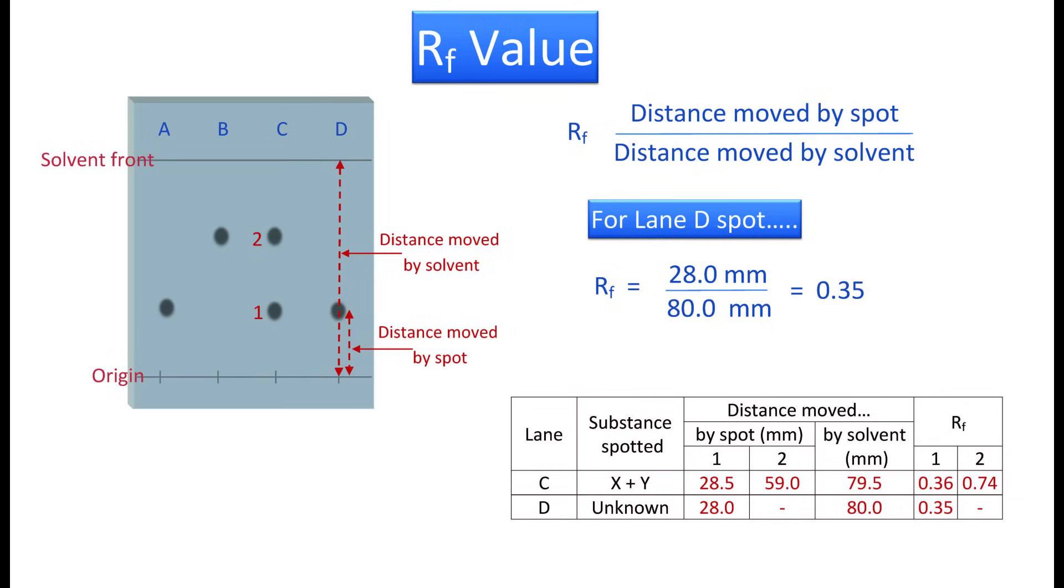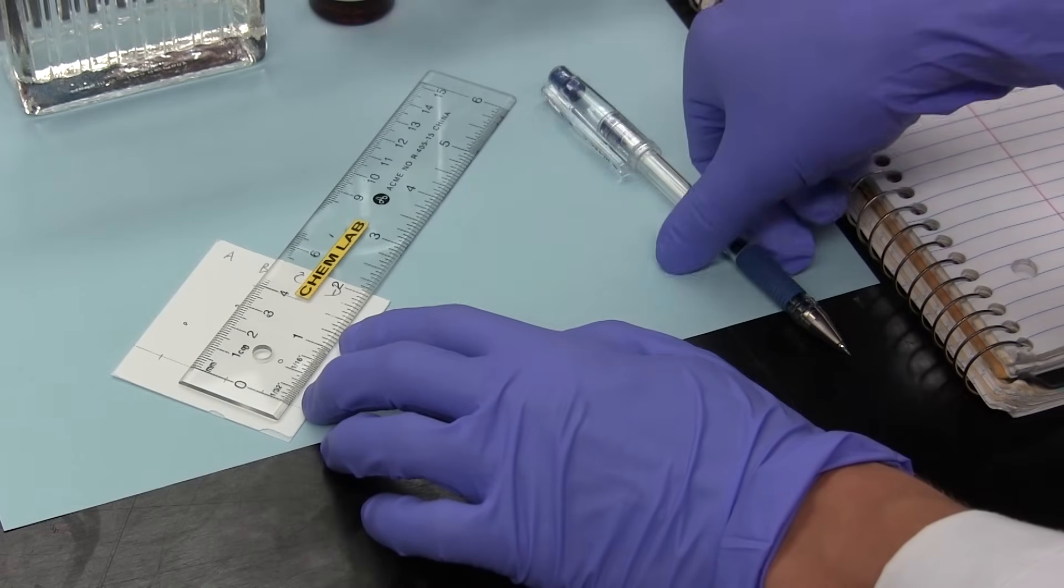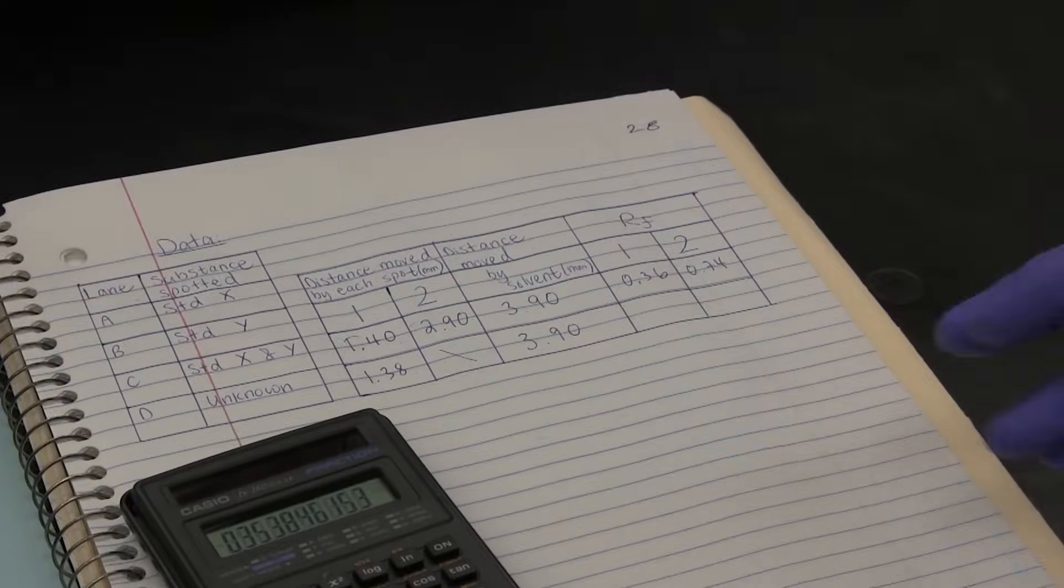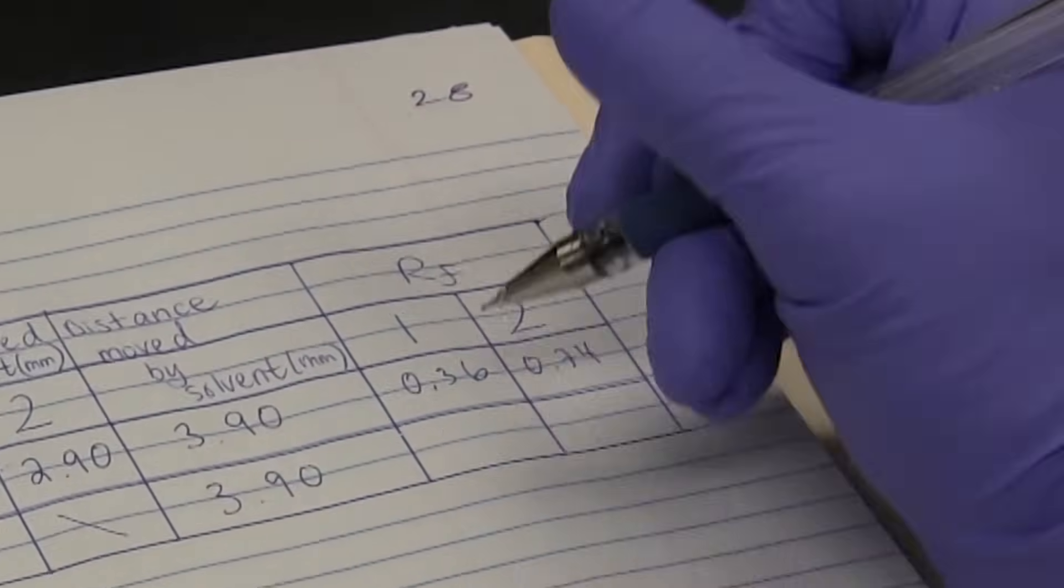In this example, the RF of 0.35 for the single spot in lane D compares favorably to the RF of standard X in lane C, so we can confirm that the unknown was in fact compound X. Here we see the measurements being made and recorded in the notebook. RF values calculated and also recorded.